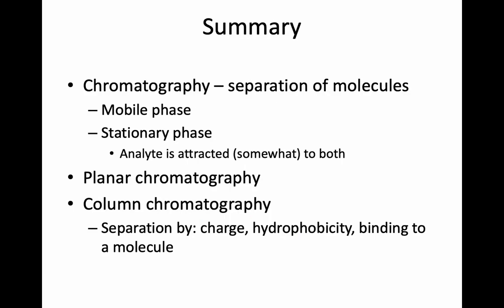So in summary, we introduced chromatography as a way of separating and analyzing a molecule. It relies on two important phases, the mobile and the stationary phase. In this lab, we are focusing on gel filtration chromatography and using the resulting data to estimate the gel partition coefficient for a specific molecule, which is cytochrome C. Thank you. Bye.